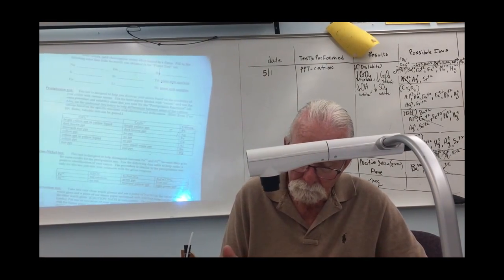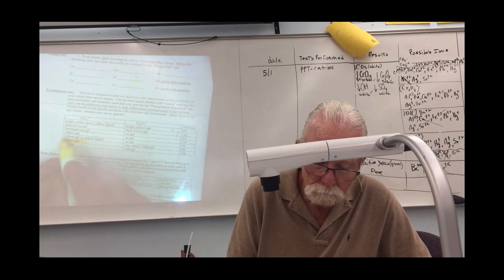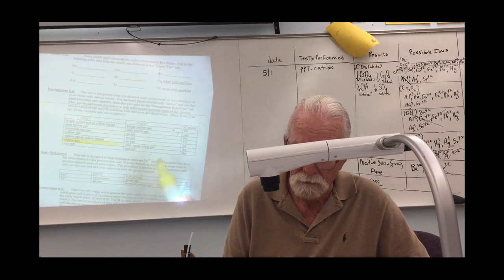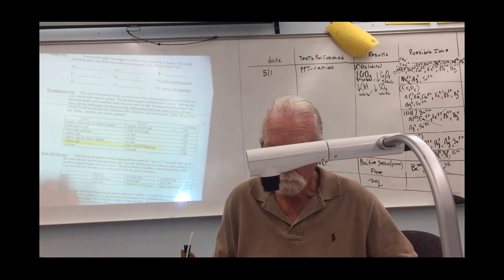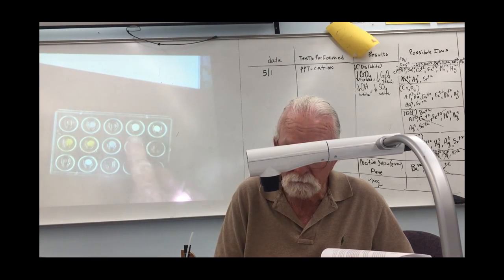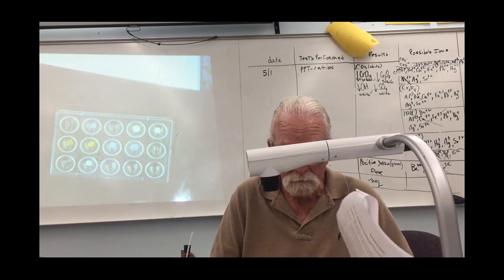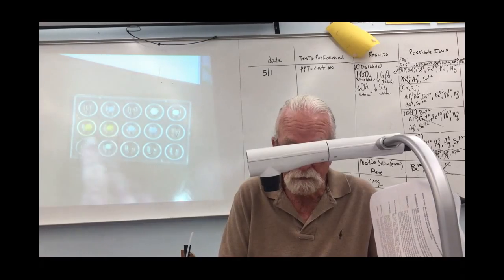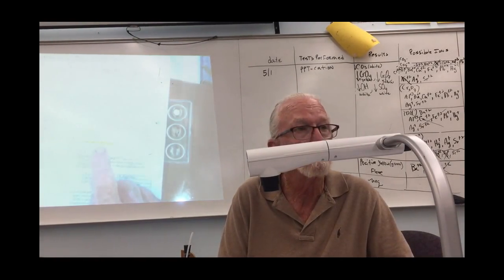If I have barium, barium should be yellow in chromate. And it should be yellow with white in dichromate. Well, they're almost identical, but they are yellow. Now, what I want you to think about here is, that's dichromate there. See, it's sort of not as bright. That's this one right here.